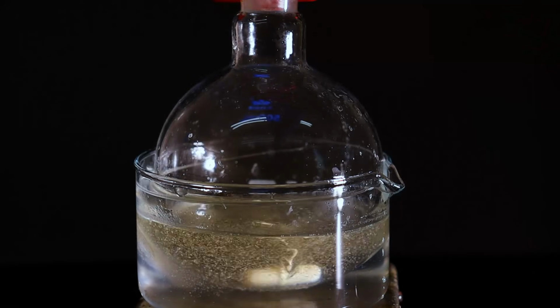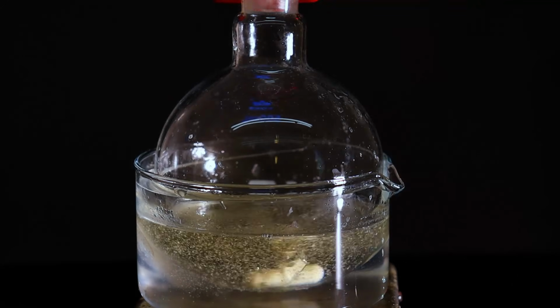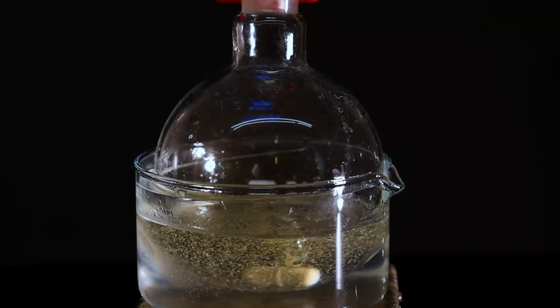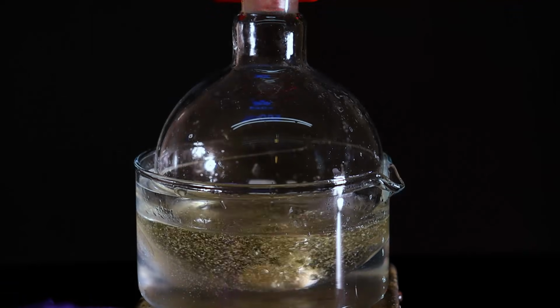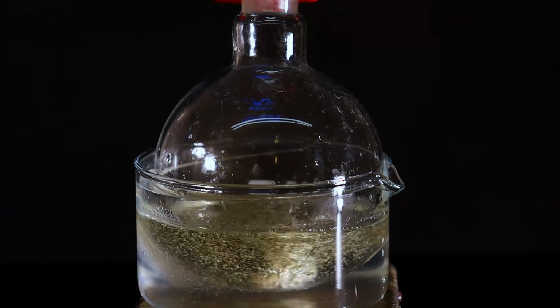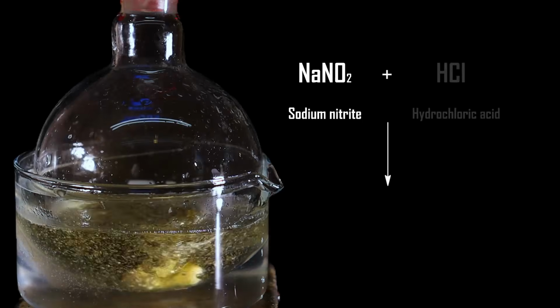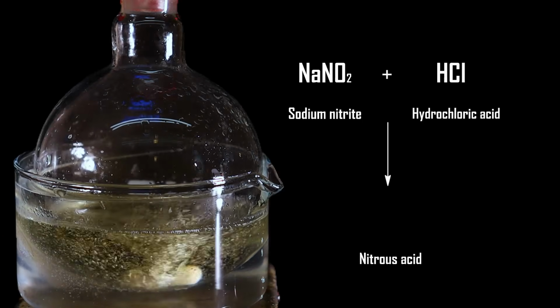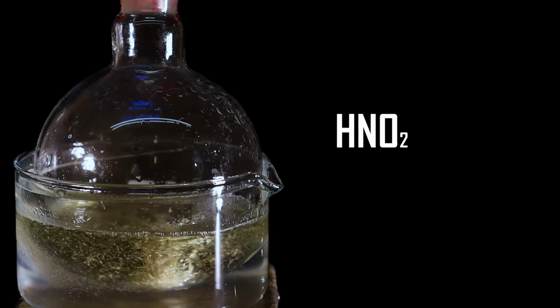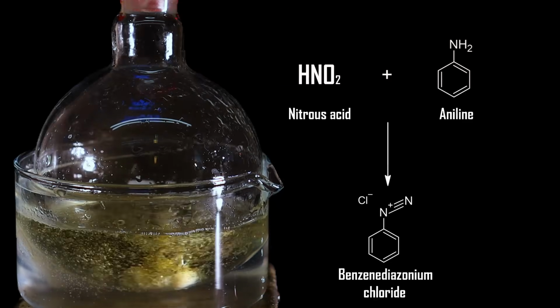This slow addition and the temperature control are extremely important here, and the yield drastically depends on them. We can also see that some reaction is taking place, judging from a brown gas that appears for a moment right after the addition of the nitrite, and the undissolved aniline salt quickly dissolves into the solution. You see, as soon as the nitrite solution drops into the flask, it reacts with excess hydrochloric acid to form this nitrous acid. This acid is just an intermediate, and it quickly reacts with the aniline hydrochloride to produce yet another intermediate, a diazonium salt.